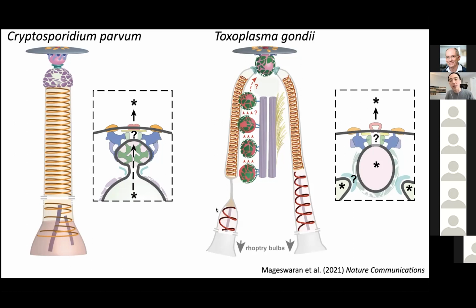That can help us start removing material and then do differential comparisons between wild type and mutant tomograms. And that can be done. Also, if you can label the protein with a big tag, and it does not affect the function too much, you can still culture them. We can also look for additional densities and compare with the wild type tomograms, and we might be able to pinpoint the location of specific proteins. So all those can be tried. Yeah, lots of cool things to do.